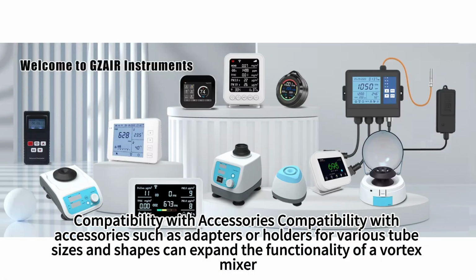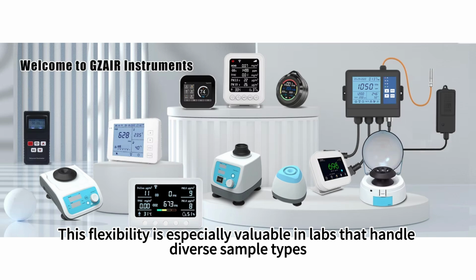Compatibility with accessories. Compatibility with accessories such as adapters or holders for various tube sizes and shapes can expand the functionality of a Vortex mixer. This flexibility is especially valuable in labs that handle diverse sample types.